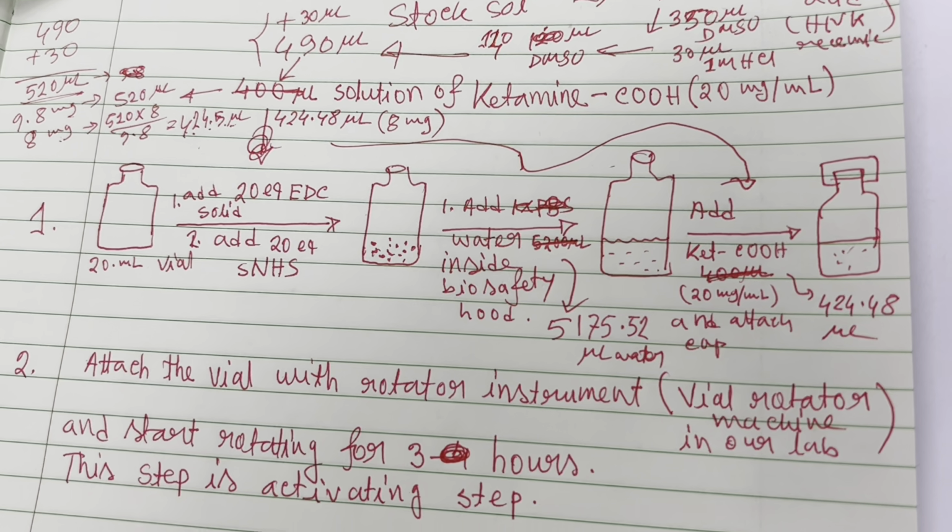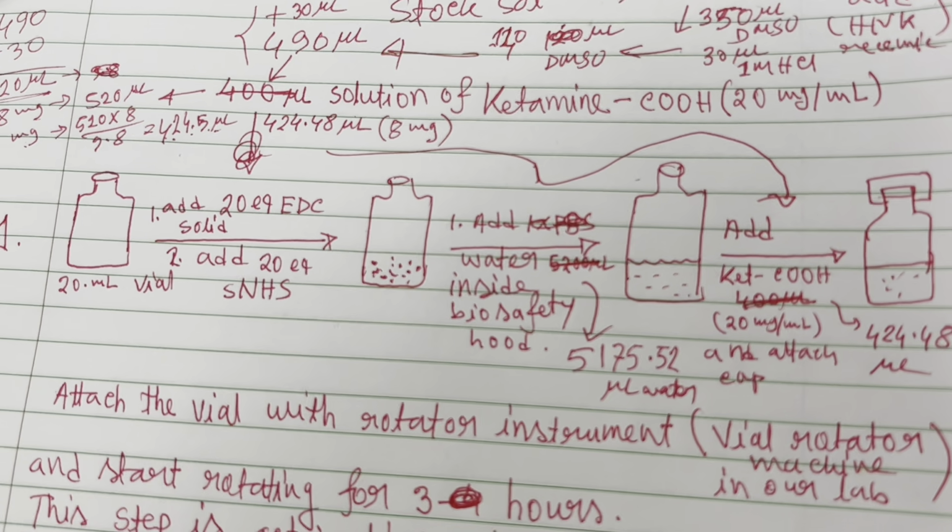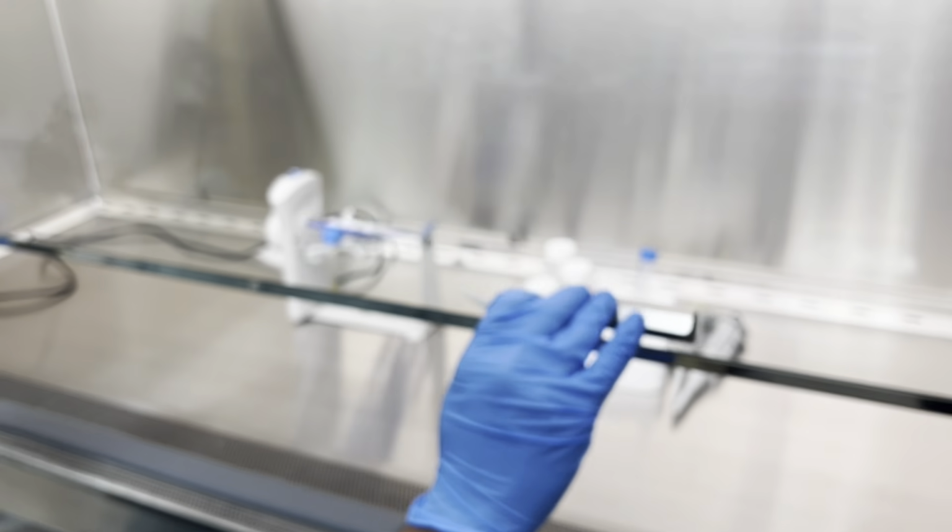Well, my question is here. Didn't it say you were adding the PBS earlier on? Oh no, you scribbled it out. Okay, so PBS is later. It's not now. Gotcha. Okay.